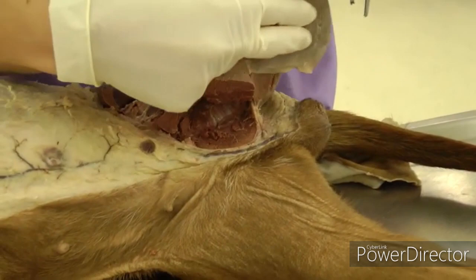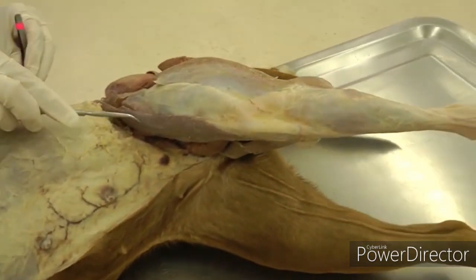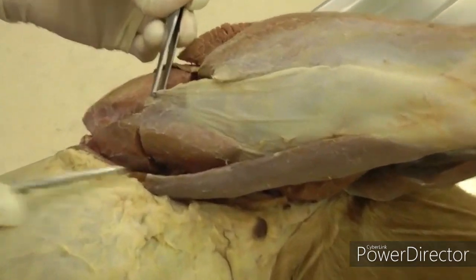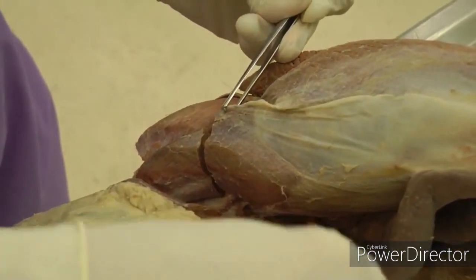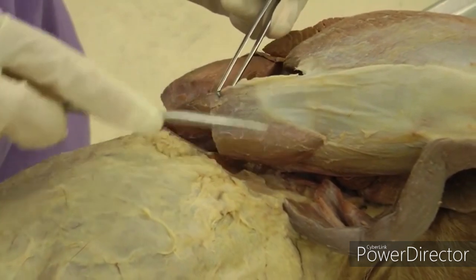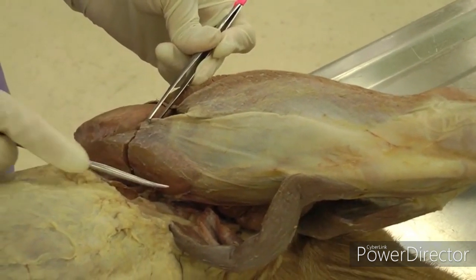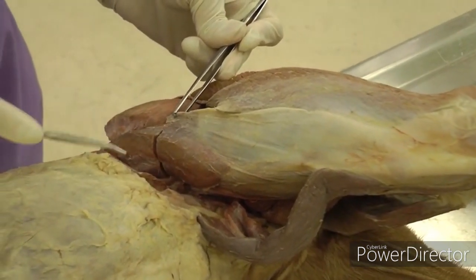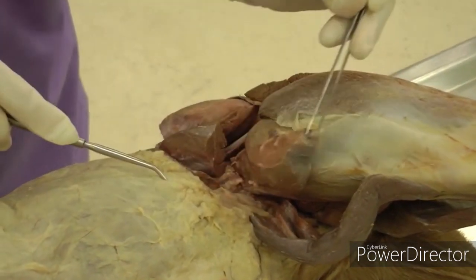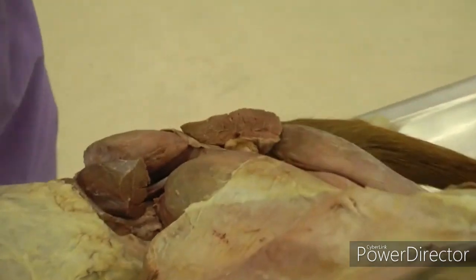Moving a little more cranial and onto the dorsal aspect: here is the sartorius that's been cut, and then you have the tensor fasciae latae. It has a triangular or pyramid shape — the muscle belly attaches to the fascia lata going down to the knee. It also has a cranial and caudal part but you don't need to differentiate those. Cut straight across, leave a small stump so you can identify it, and reflect it down — again, try not to cut the fascia lata.